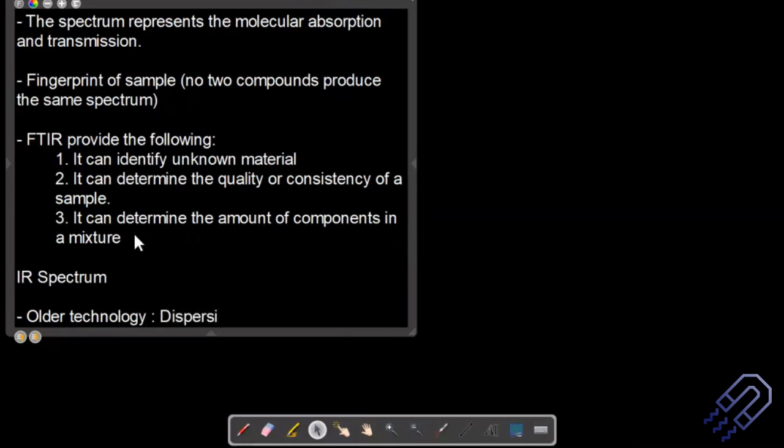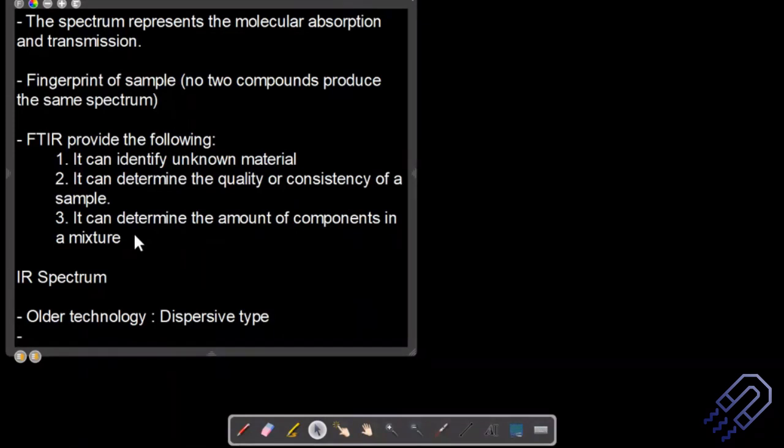There is something which we call the dispersive type. I hope all of us understand what dispersion is. I have taken this answer a number of times from students: when I ask why white light splits into 7 different colors and what the process is called, I have even heard people saying scattering, and maybe diffraction. But it is dispersion. What is getting dispersed here? The wavelength and frequency components are getting separated, and that is what is called dispersion.